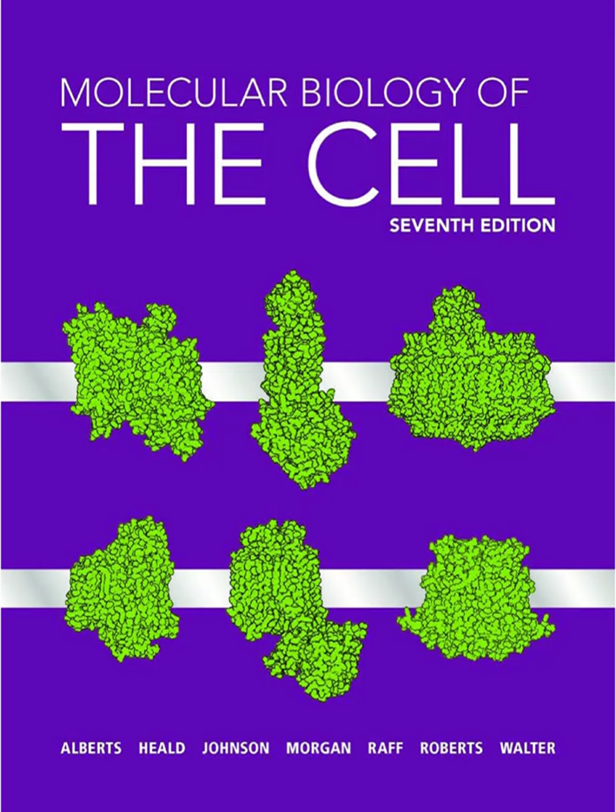Much faster and much gentler. You can acquire entire 3D volumes very rapidly, hundreds of image planes per second, making it ideal for watching dynamic processes in whole embryos over hours or days, and for rapidly imaging large cleared tissue samples like entire mouse brains to trace neuronal circuits. Amazing.